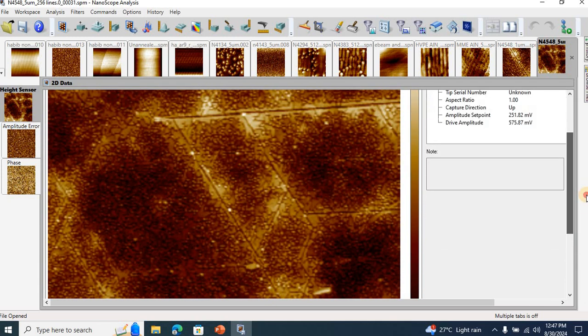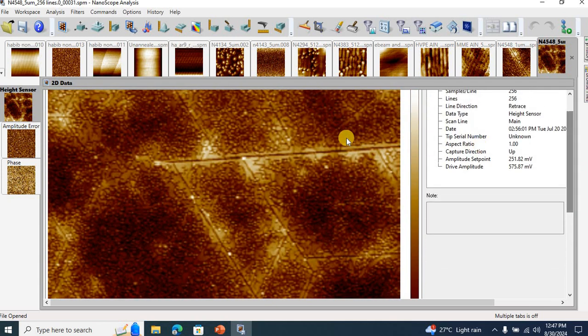And here is aluminum nitride grown under high quality growth conditions, but on top of gallium nitride film. It's a heteroepitaxial growth, and we know that aluminum nitride has approximately a 4% lattice mismatch with gallium nitride.